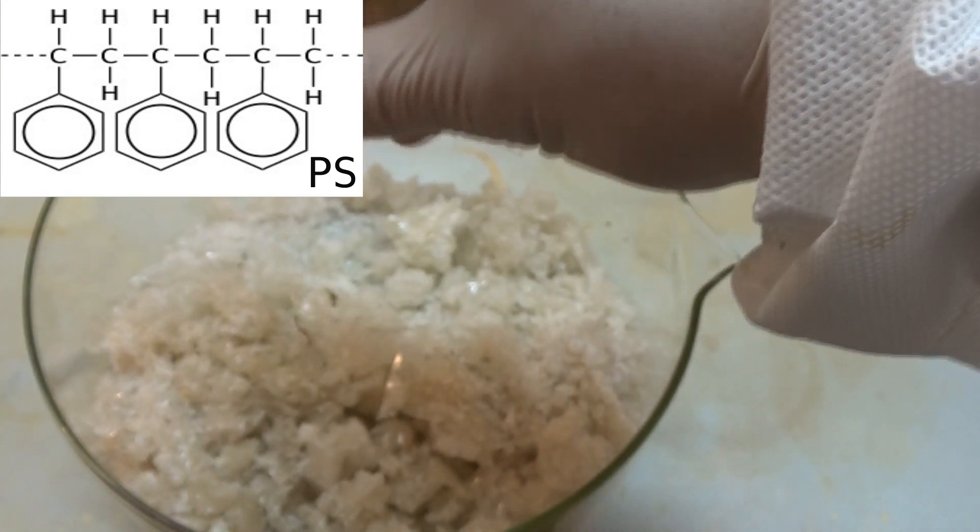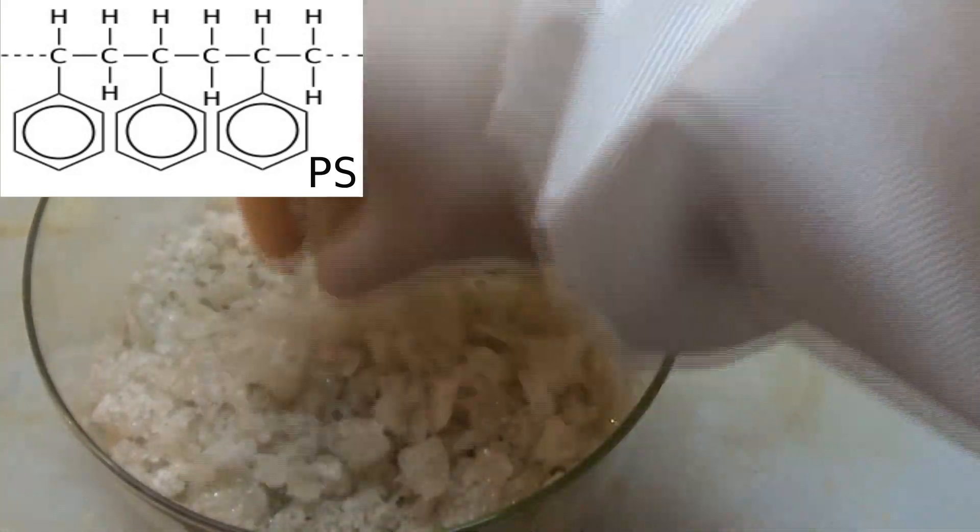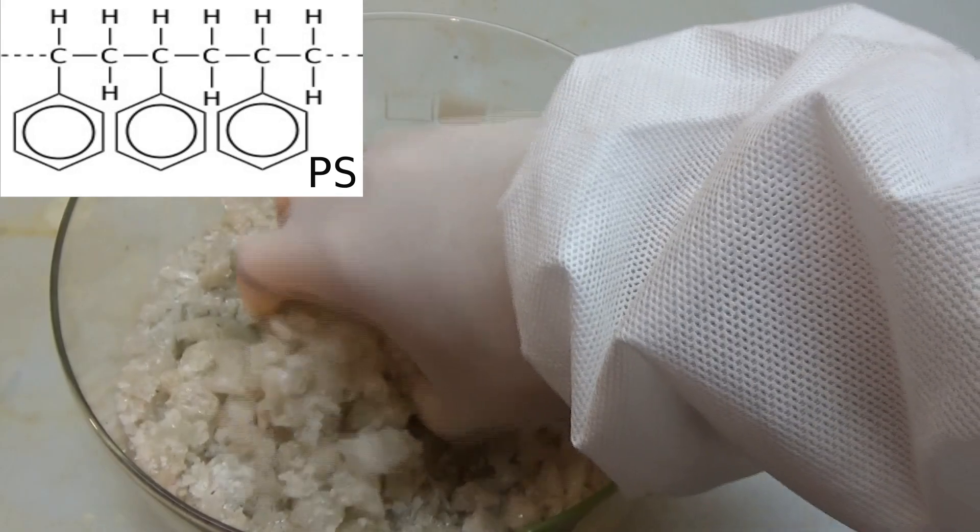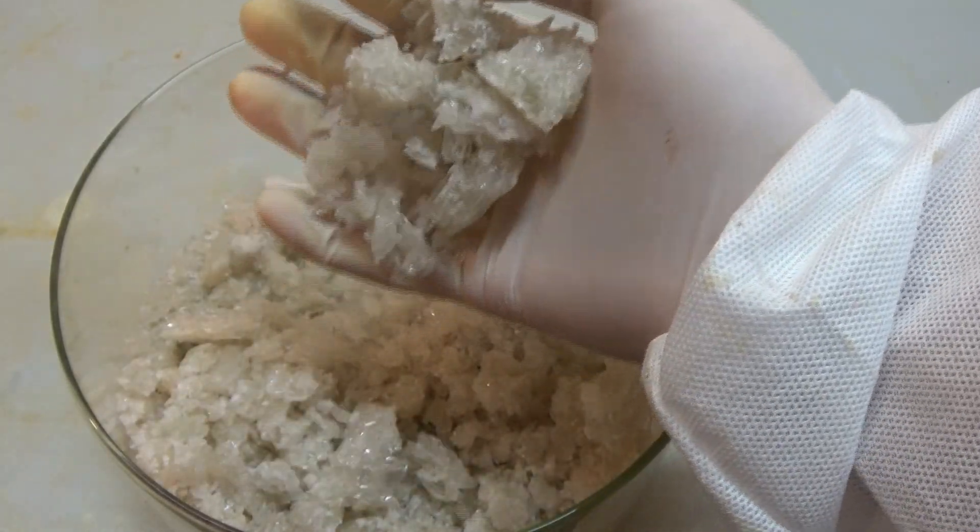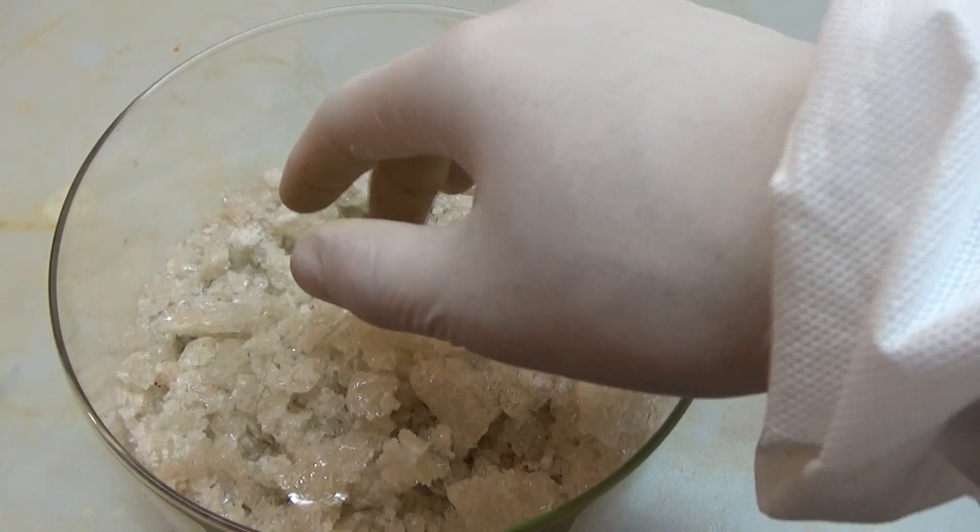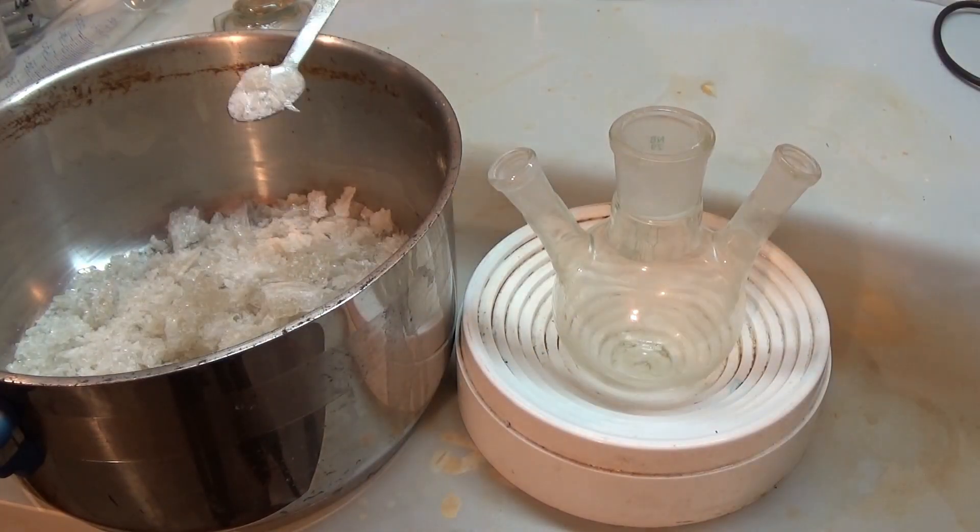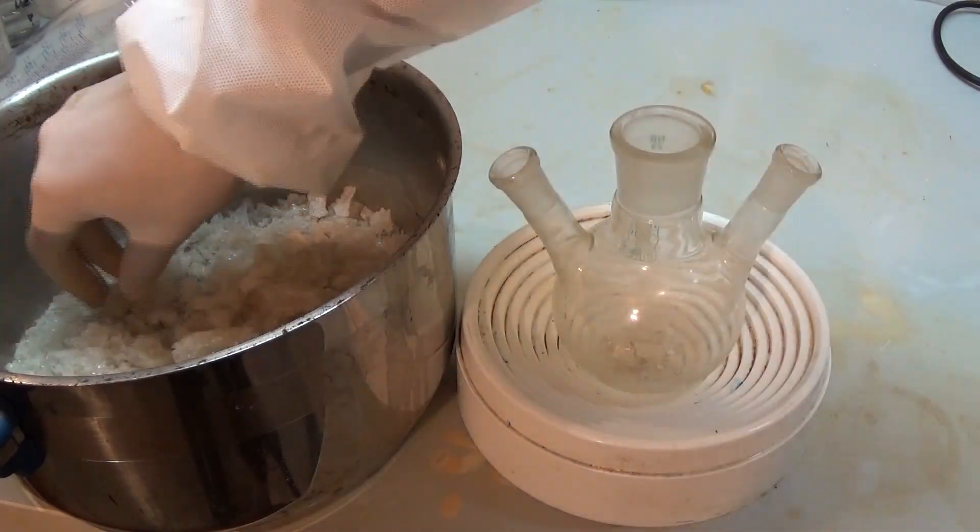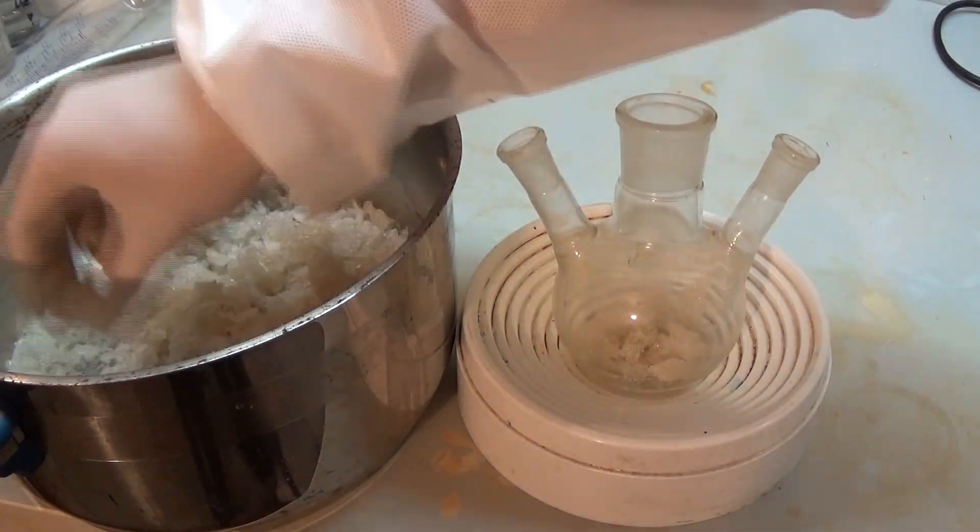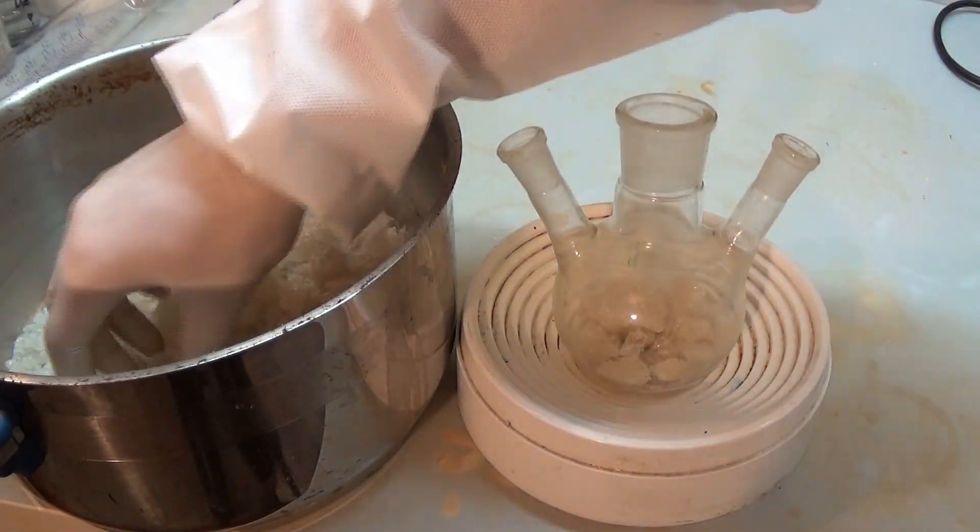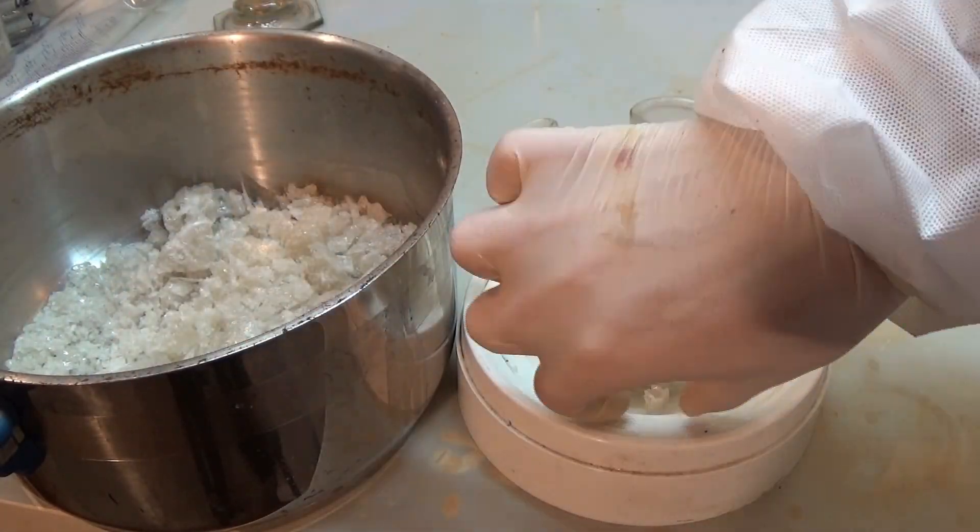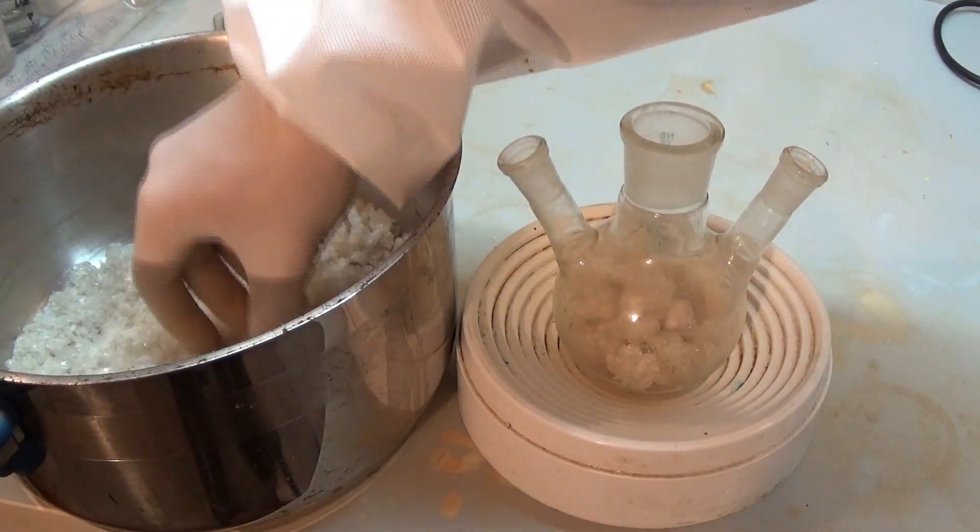But let's look at what polystyrene is. PS is the polymer of styrene and is produced by reacting styrene with itself to form the polymer. But for a good and constant polymerization you need a catalyst. Interestingly, styrene can polymerize spontaneously with anionic, cationic, or radical catalysts, so you have a wide variety to choose from.